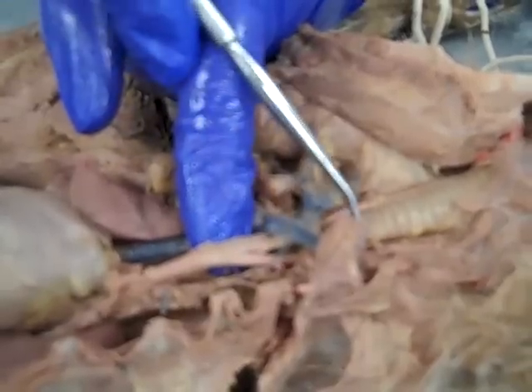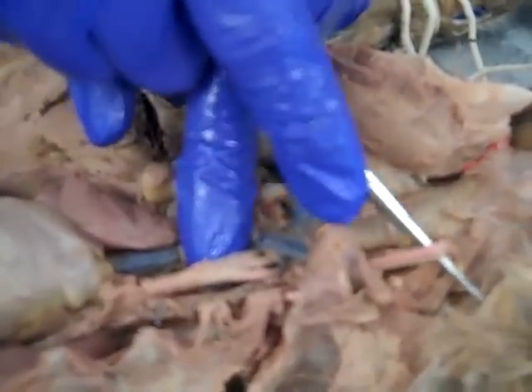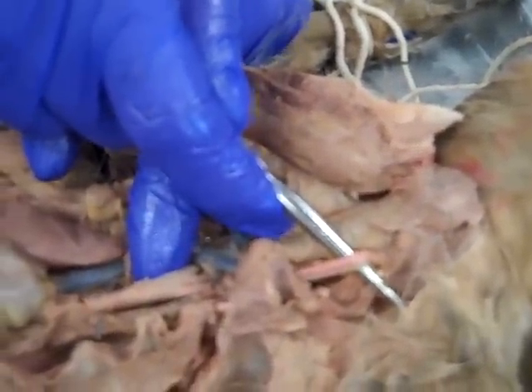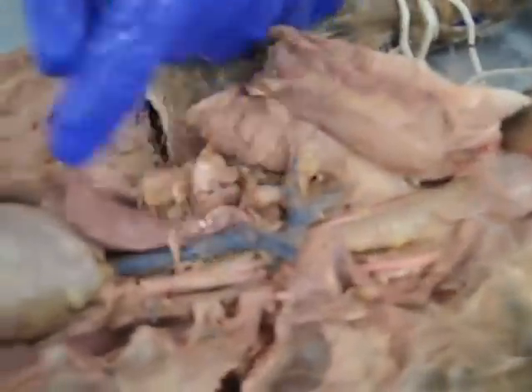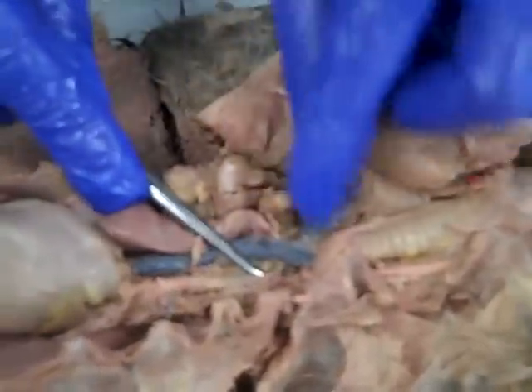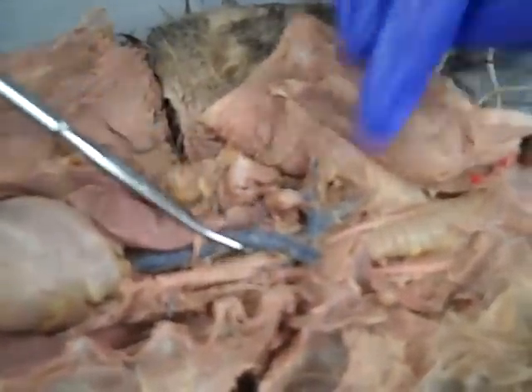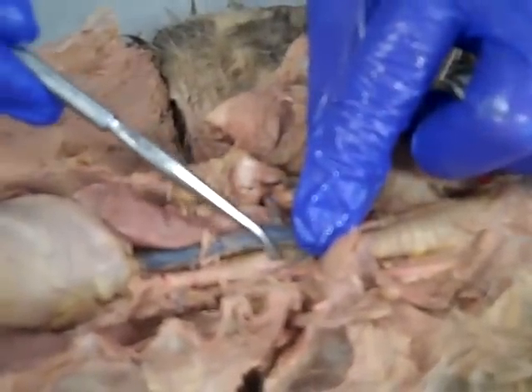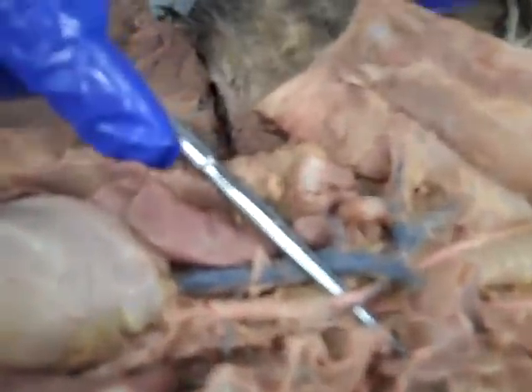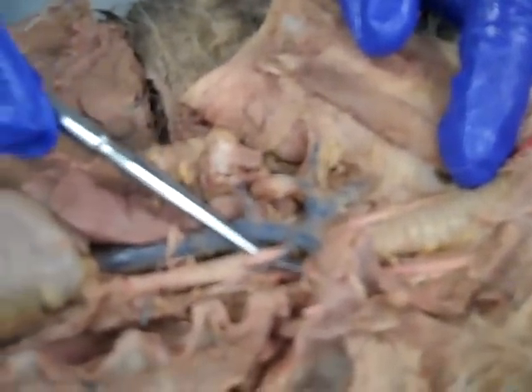And if we follow the left common carotid up, we can see it right next to the trachea. And if we keep going up, we would eventually, hopefully, see it split into an internal and an external carotid. The middle branch here, if I can get underneath it a little bit, there we go. The middle branch of the brachiocephalic artery right here is the right common carotid artery, which we can then follow upward alongside the trachea as it goes up into the neck.